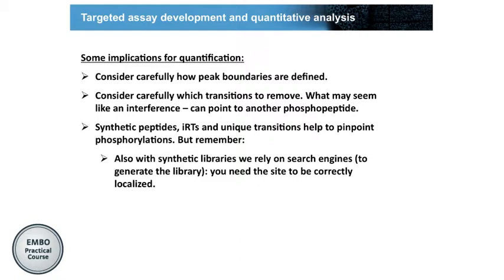And in this respect, to avoid the use of search engines, you can also do chromatogram-based libraries, but this is going to be Brendan. You're going to talk a bit about Panorama. There are other options without search engines.